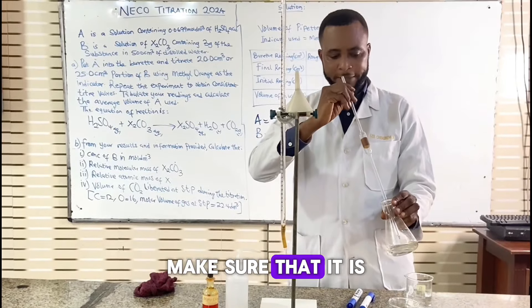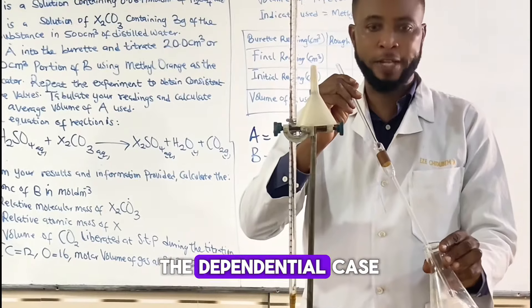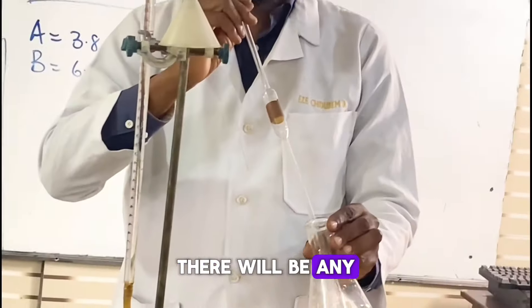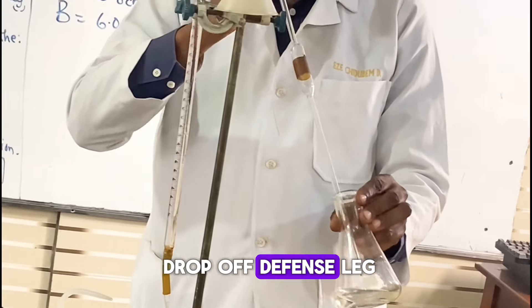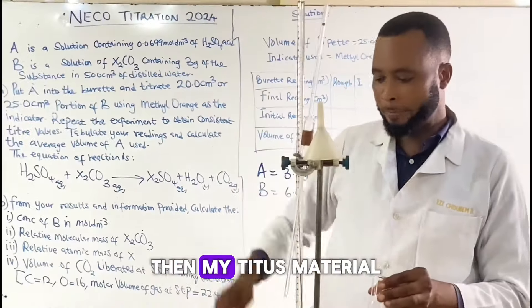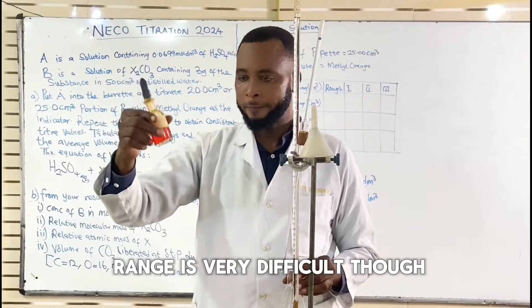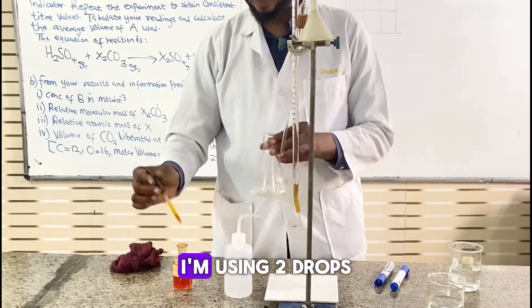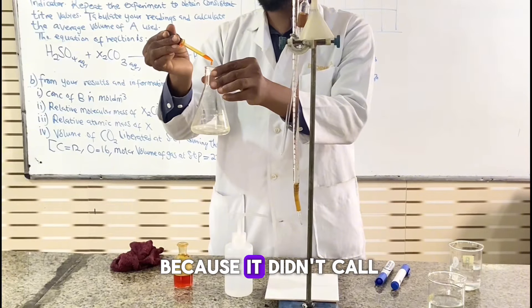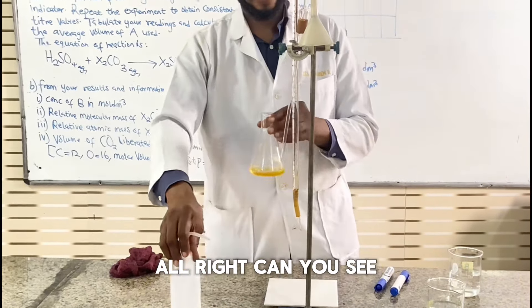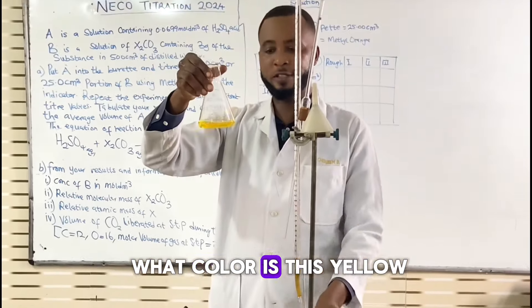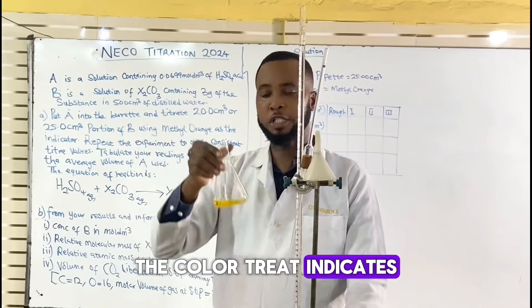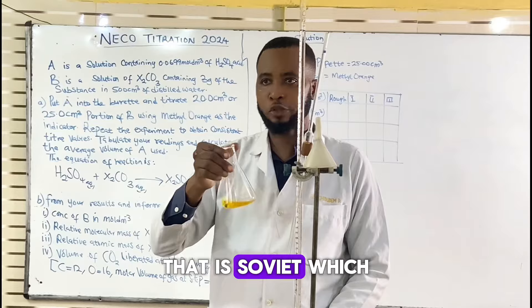Make sure that the tip of the pipette touches the base of the conical flask, so that there won't be any drop of the base left out. You can see that my indicator is methyl orange — it's very deep in color. I'm not going to use three drops; I'm using two drops, because it's deep in color. Can you see? The color is yellow. The color will indicate the endpoint.